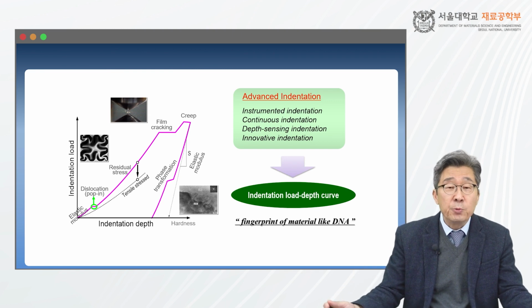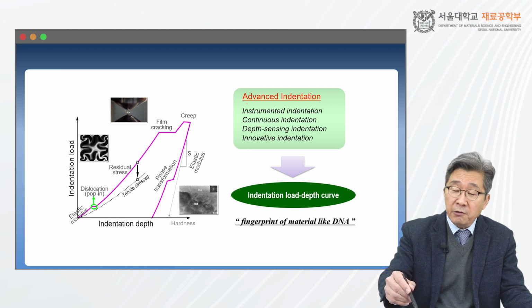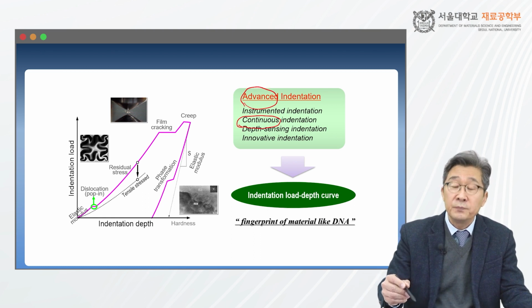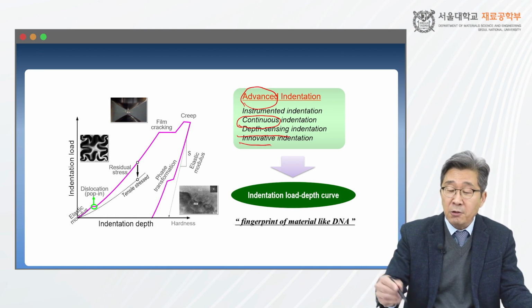Therefore, instrumented indentation testing is called by different names, which reflect aspects of the testing, like advanced indentation, continuous indentation, depth sensing indentation, or innovative indentation.